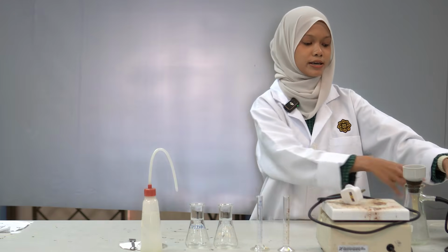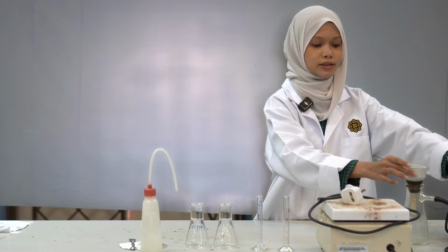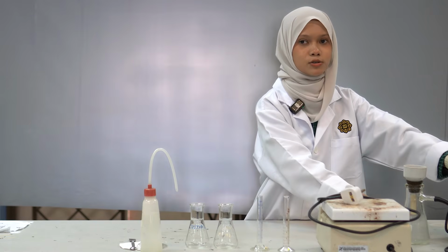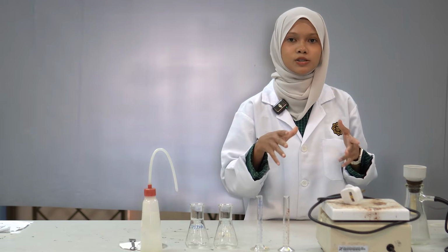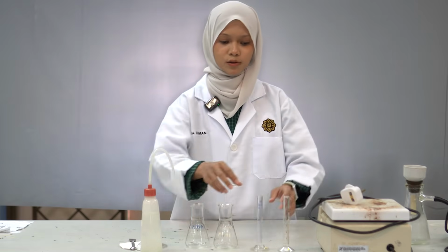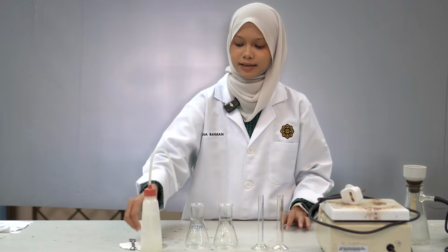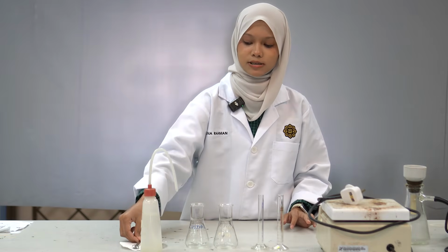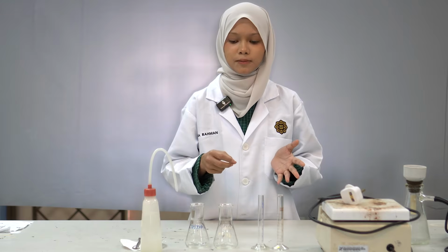And then we're going to use a pump filter and this porous filter funnel. This is crucial for the final step later, where we're going to separate our dry crystal from our solvent. And then we're going to use 2 graduated cylinders, a dropper and a spatula. These are the measuring and transferring tools, ensuring that we use the right amount of solvent.